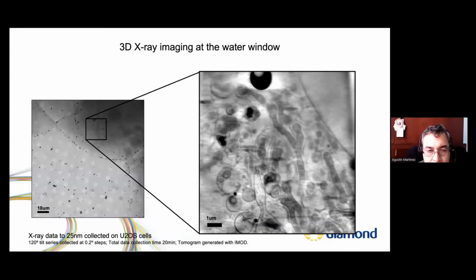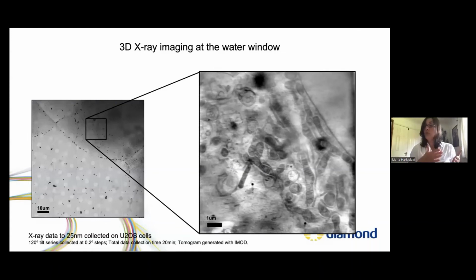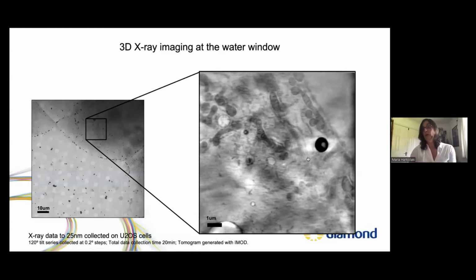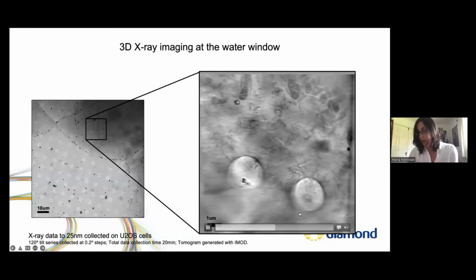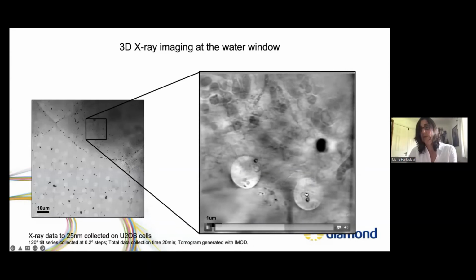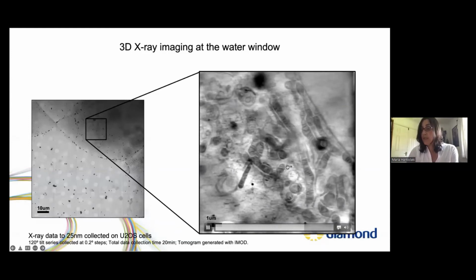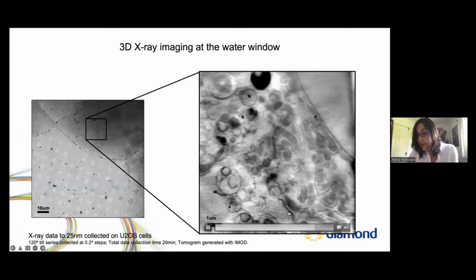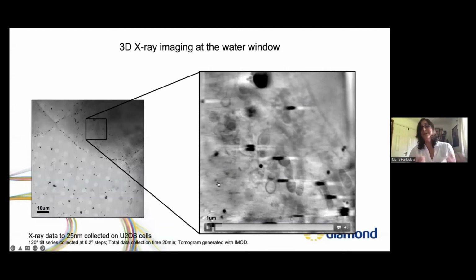So we have now reconstructed it from a series of projections into a full volume. If you see this volume now, you can see the nucleus on this side. These holes are the perforated film that's holding the cells, and we're going back inside the cell. You can see all the mitochondria, the cristae, the ER, and all the membranes that surround them. These are all endosomes and multivesicular bodies, the digestive system of the cell effectively. And at the very top, these are gold fiducials that we use for alignment. So this is the data that we get.